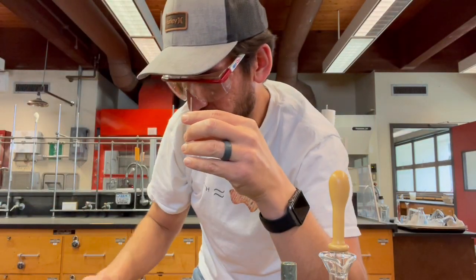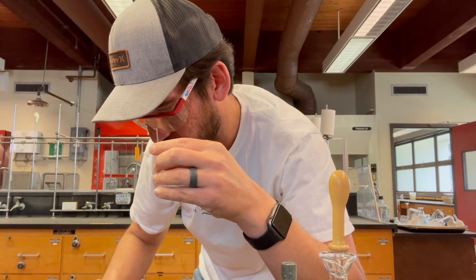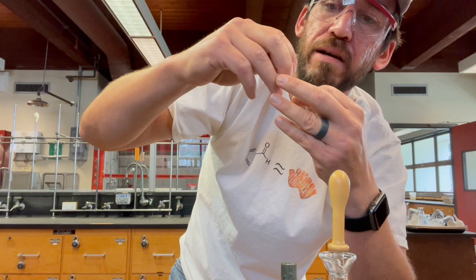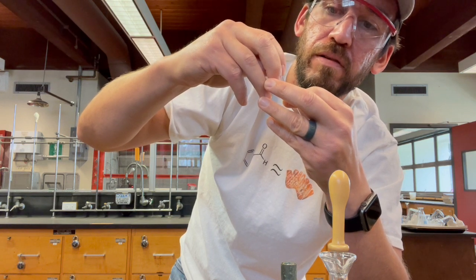Now what we got to do is find our micro bell and carefully place that upside down inside of here.